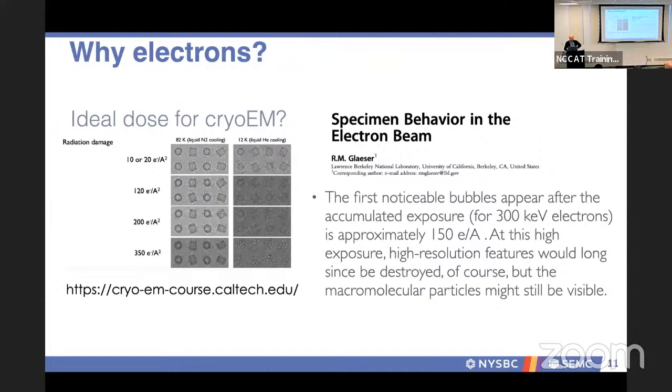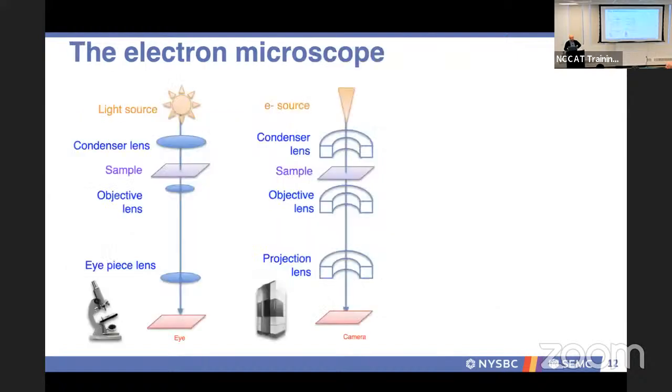So there's a balance between how much dose you want to use to be able to process your data, to be able to interrogate particular regions of interest, versus if you're also trying to get resolution. So that's really the balance where people are really trying to push for resolution, but if resolution is your only criteria, that's why in the previous example, you might only be after 5 or 10% of your sample, because if you're dealing with single particles, unless you have a very stable sample, you have heterogeneity, not just identity. So it might be identity-wise very homogeneous on a size exclusion or your purification, but conformationally heterogeneous. And so how do you deal with that?